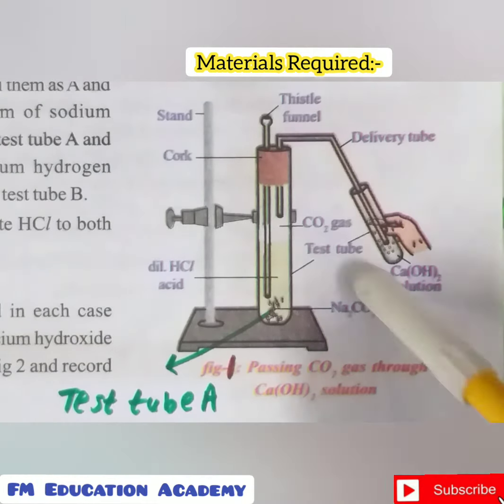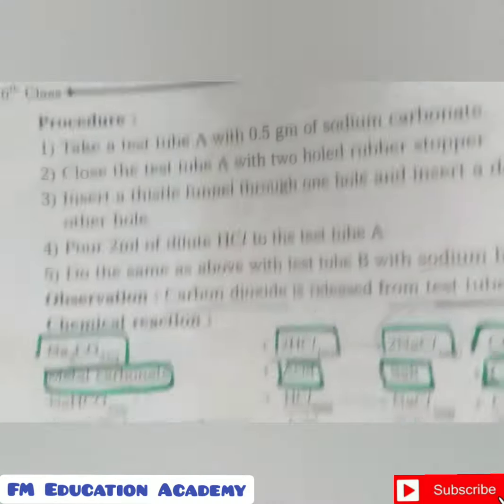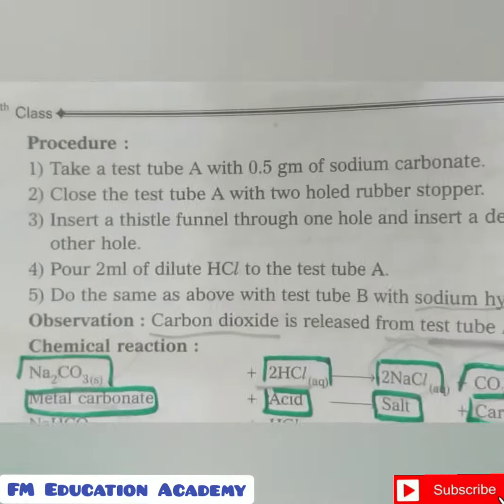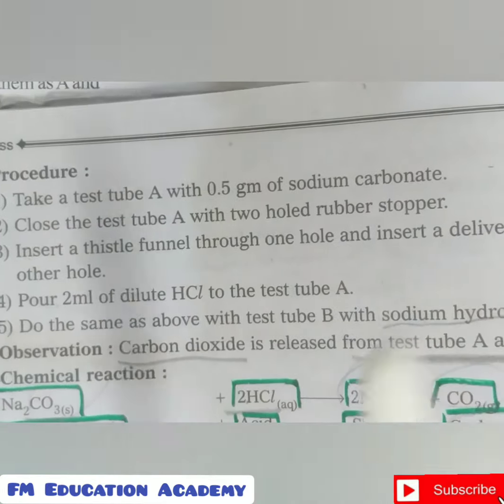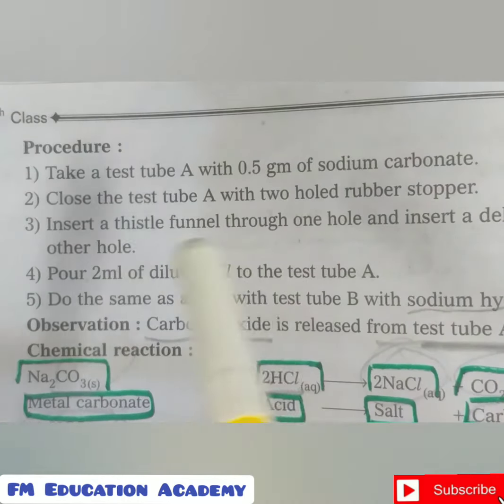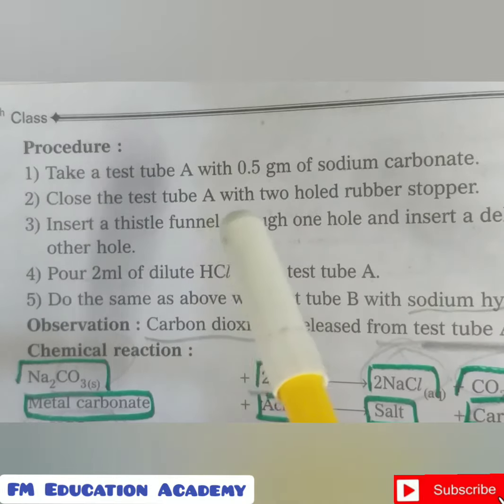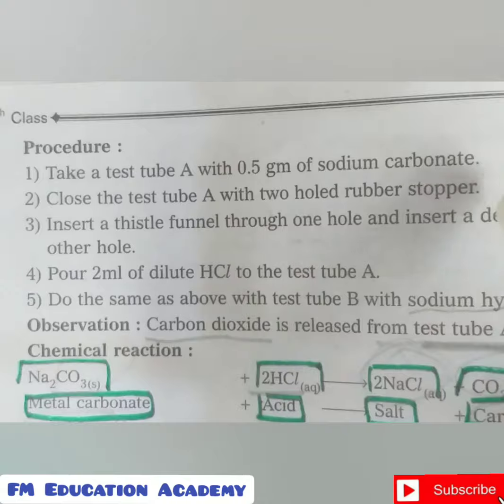In the first case, we are taking a metal carbonate, that is sodium carbonate, in the test tube. Take a test tube with 0.5 gram of sodium carbonate. Close test tube A with a 2-hole rubber stopper. We know that, right? When we take sodium carbonate inside it, we are naming the test tube as test tube A. What do we mean by a 2-hole rubber stopper? We are making 2 holes in the rubber stopper, right?